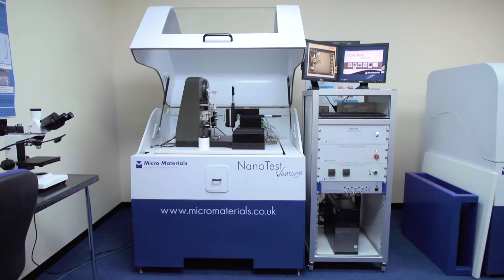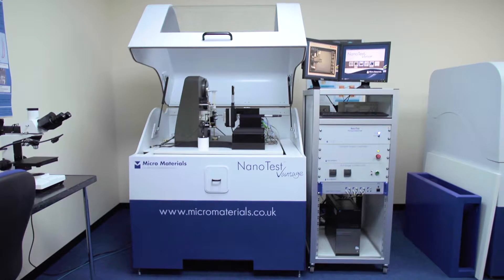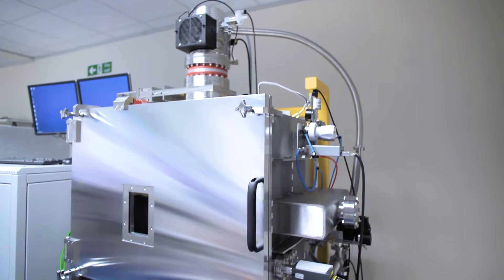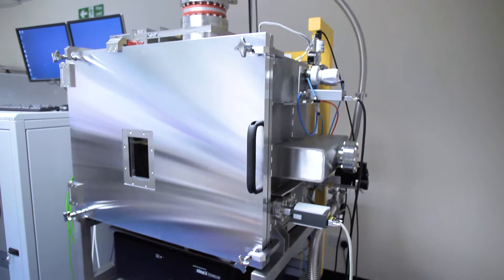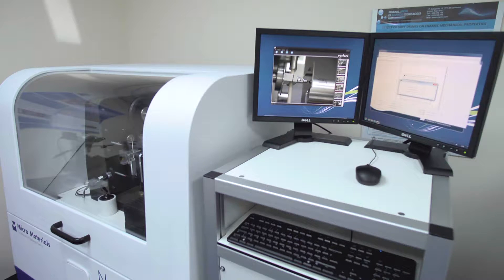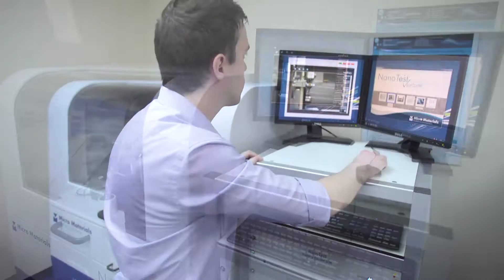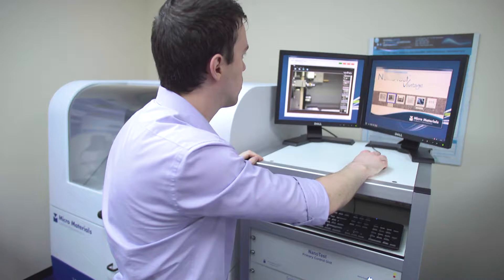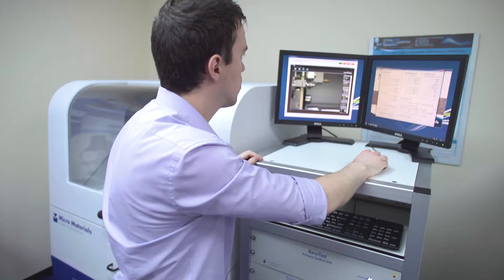The NanoTest systems from MicroMaterials are designed with ease of use and flexibility in mind. The latest NanoTest software has a clean, simple interface that is easier to navigate and more intuitive, making it ideal for both new and inexperienced users.